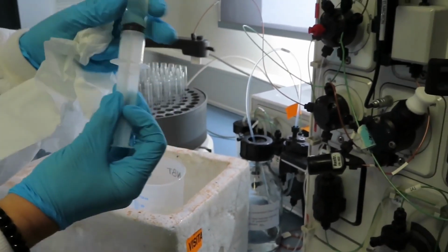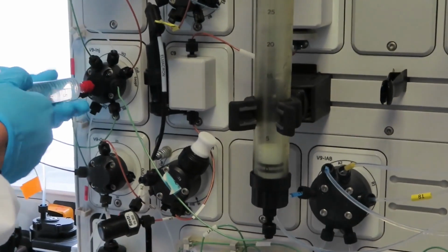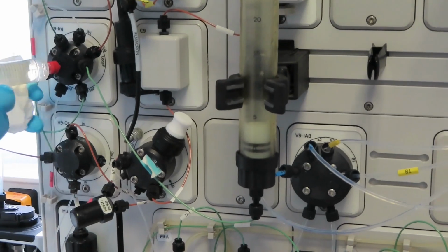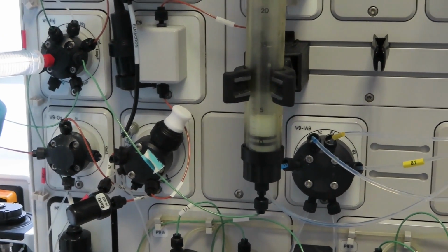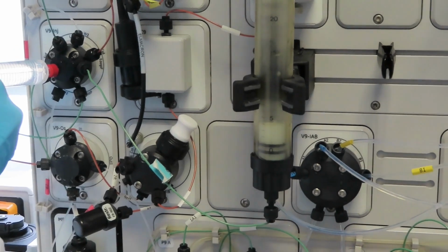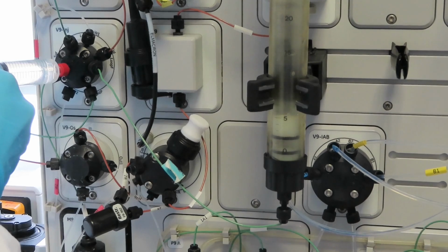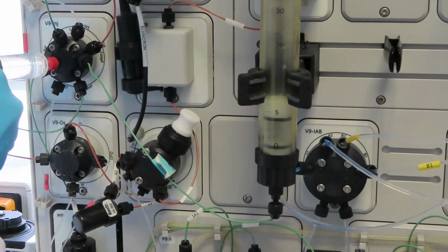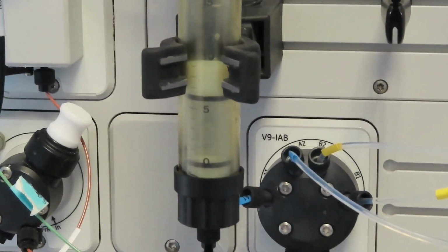Once the column is equilibrated, the sample must be injected into the column. For this purpose, first it's necessary to load the sample inside the injection system. Depending on the volume of the sample, a loop for some microliters or a superloop for a maximum of 50 milliliters can be used. For large volumes, the superloop can be loaded several times or the external pump can be used directly. The sample must be loaded in the injection system, ensuring again that no air enters.